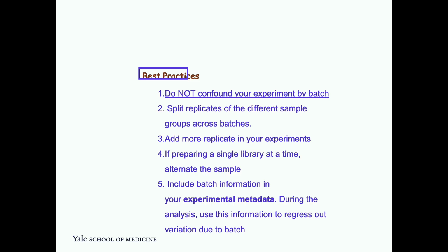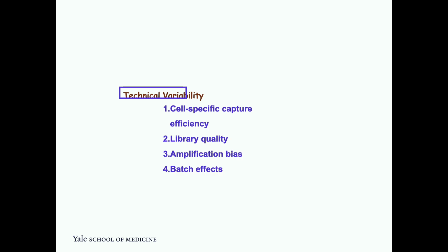That will also help you, and add as many replicates as possible. This is easier said than done. The biggest problem is the cost. Even for RNA-seq, people are reluctant to add more replicates. Here you are talking about 10 times more cost than bulk RNA-seq, so it's a harder thing to do. And also, whatever Francis told you about RNA-seq is relevant: always collect all the metadata about your experiment, and that will help us understand the batch effects.